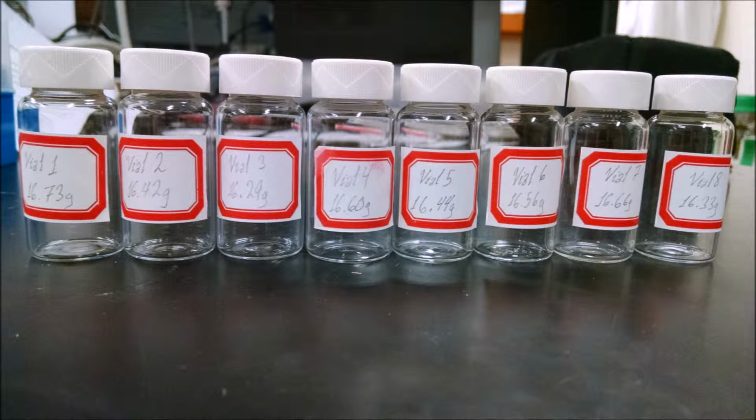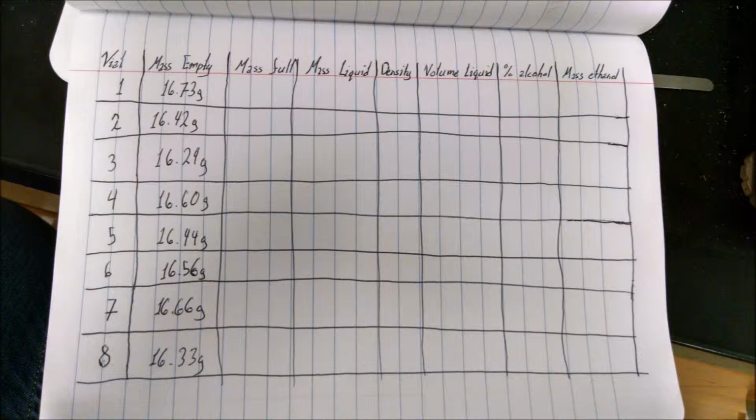Using the scale, mass 8 separate vials. Label them with their mass and the numbers 1 through 8. It is very important that each vial remains with its own cap. To record your results, create a chart like this.